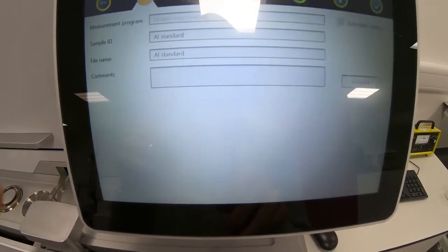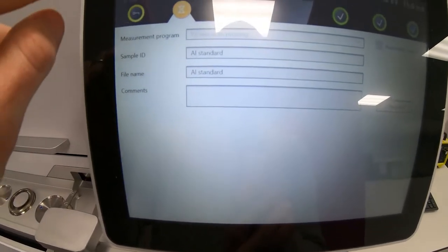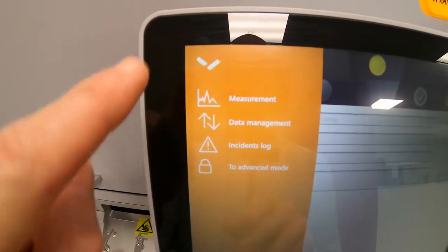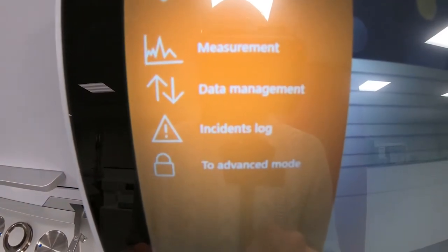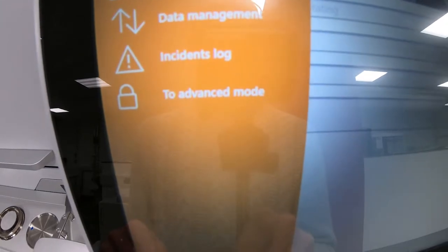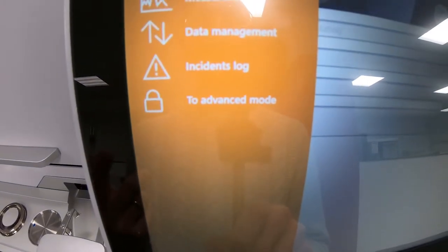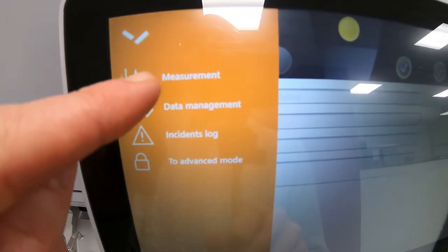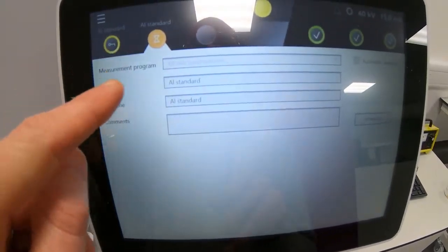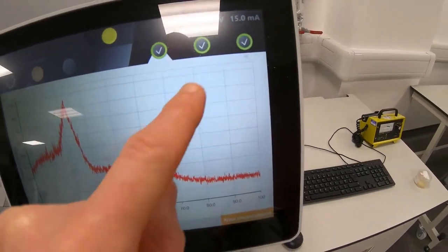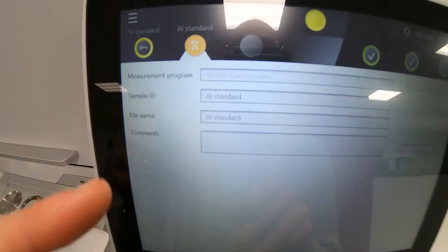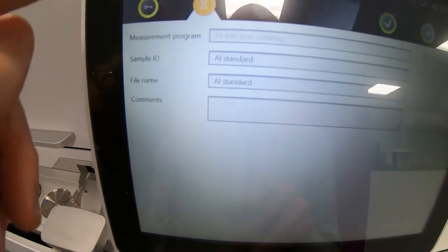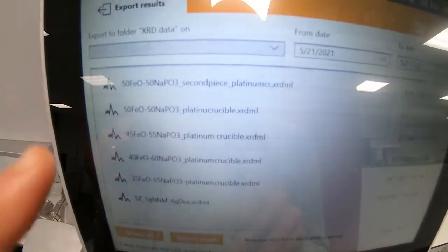So while we're waiting, I'll just quickly talk you through the menu system. We press this burger icon up here. You can see we've got some options: measurement, data management, incident log, and to advanced mode. You won't be able to go into advanced mode, but if we talk about the first one, that's how you get to this screen where you can view the data that's already been collected or which data is being collected or which data is waiting. If we go to data management, this is where we transfer our data to our memory stick.